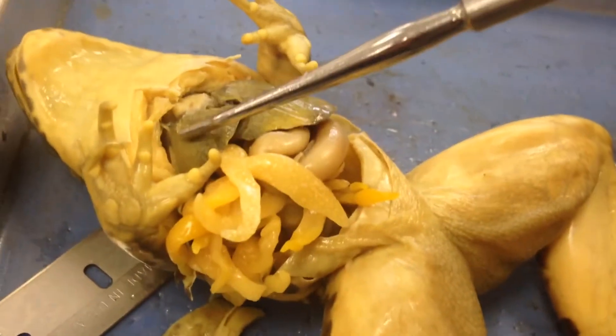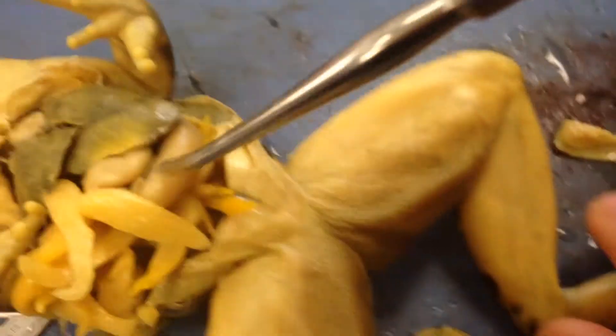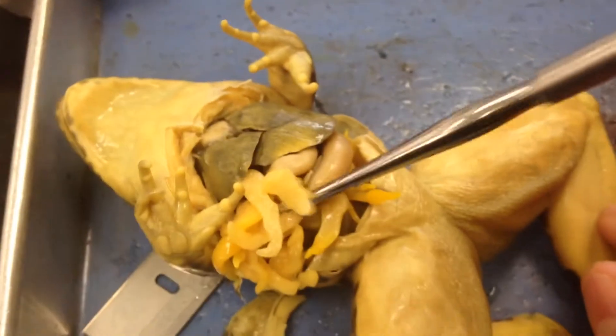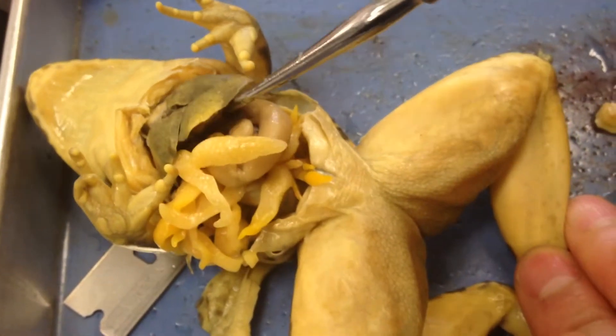Inside a frog, it has a liver which has three lobes — one, two, three. It also has its large intestine here, and you can see its fat bodies, where it stores fat. Unlike humans, where we store fat in our muscles, if you lift this up you can see some of the small intestine.